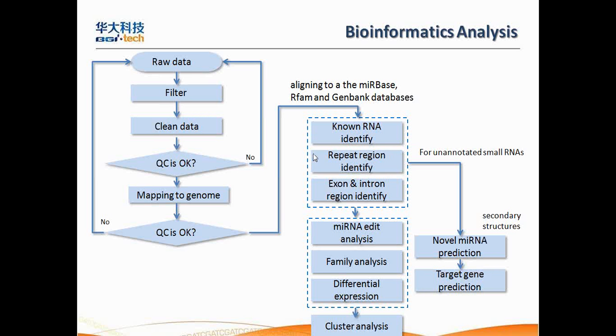For those already known small RNAs in our sequencing reads, we will do other analyses, such as whether this microRNA is edited or not, and which family it belongs to.